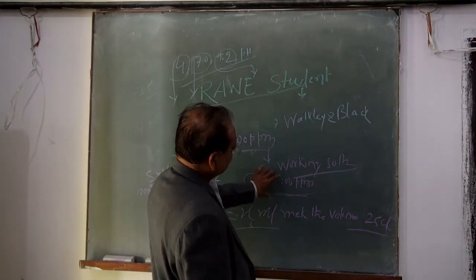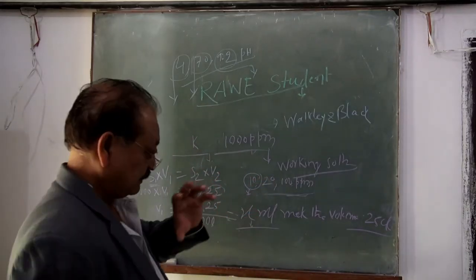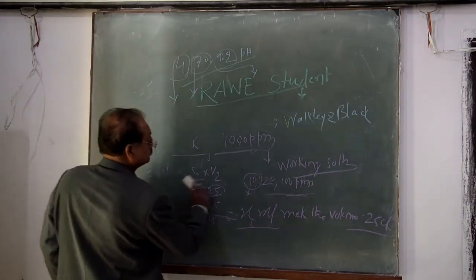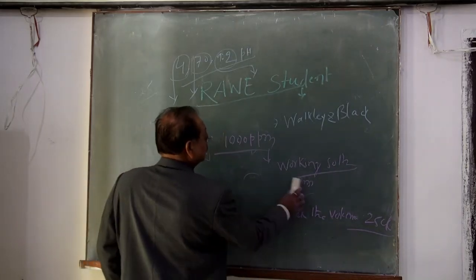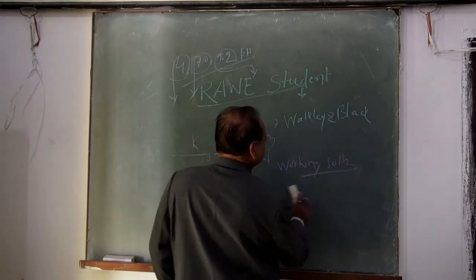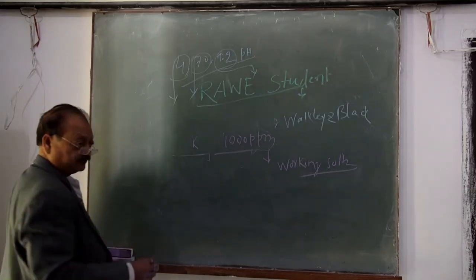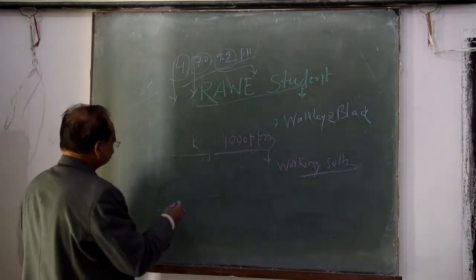After calibration, you run your samples and take the reading of the flame photometer. Before taking the reading, always remember one thing: you have to run your standard solution, and after calibration of the instruments, you go for the unknown solution. Unknown solution means your soil sample solutions.